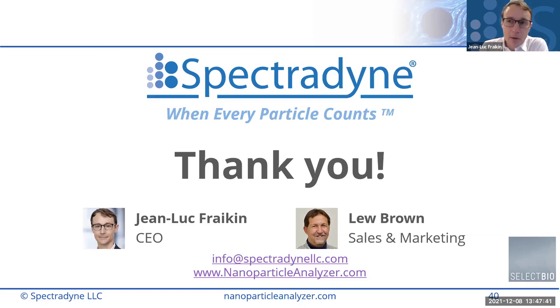The overall concentration range of our platform, from 50 nanometers size to 10 microns diameter, spans from 10 to the 4 particles per mL up to about 10 to the 11 particles per mL. So that's the answer to your first question.